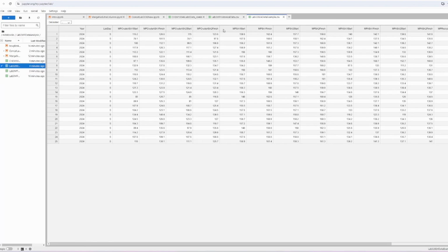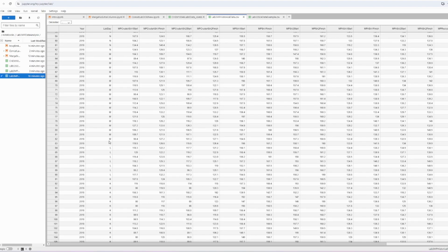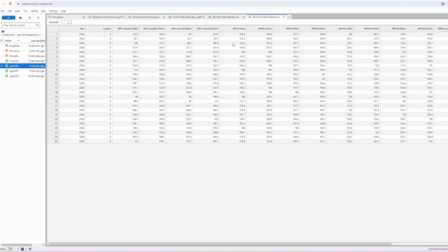The columns exactly match the other set of columns here. That's important that that happens, and I'll make sure that we do that when we're in lab and we input our data. So in lab, you will actually do your melting points, and then you're going to need to tell me the start and the finish, start and the finish, and so on for all of these data sets.